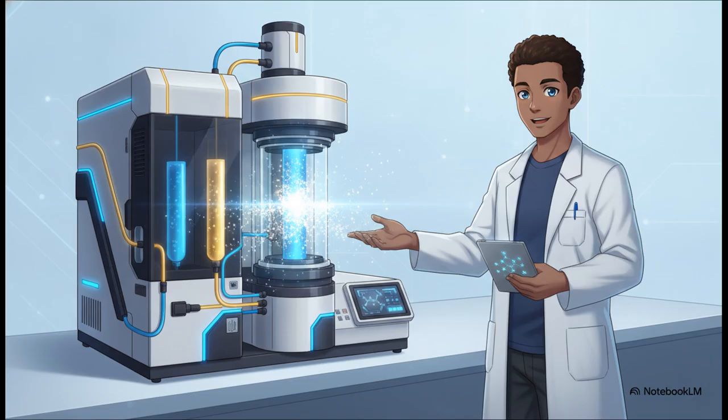You can use UV-Vis, fluorescence, ELSD, CAD, or refractive index. But here is the absolute game changer. Because HILIC uses so much highly organic mobile phase, it is exceptionally compatible with LC-MS. The high volatility of that acetonitrile practically supercharges your ionization efficiency, giving you off-the-charts sensitivity for polar analytes.